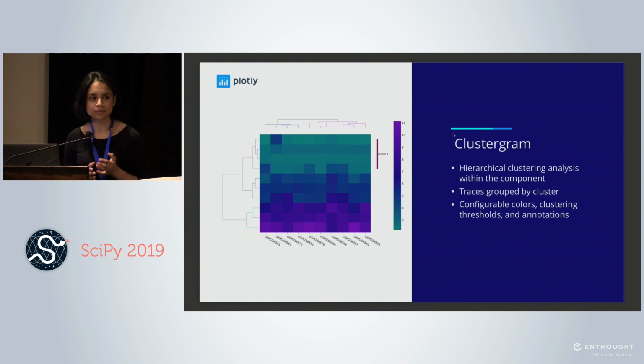But of course, if you're a little bit more particular, Clustergram also supports you defining your own functions that will be used to compute the clustering. And since Clustergram has a plotly.py backend, you're able to capture user interactions like hovering and clicking in order to use those in another part of your app.